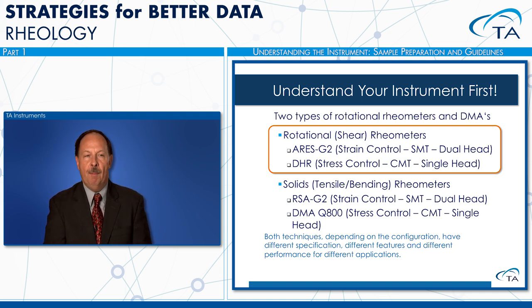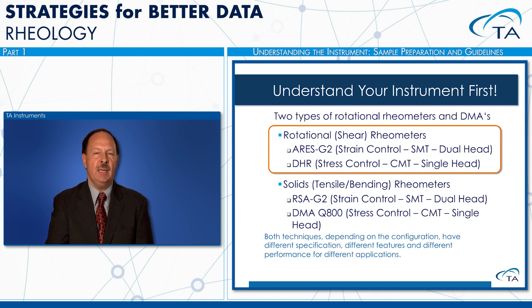We will call these combined motor and transducer. These are single head instruments. And you would use a rheometer for fluids, definitely, but it also has the capability of doing a lot of testing on solids and solid-like material, which we'll discuss.